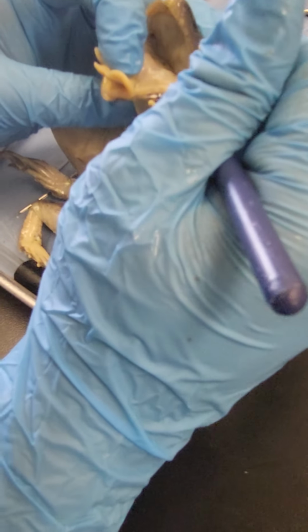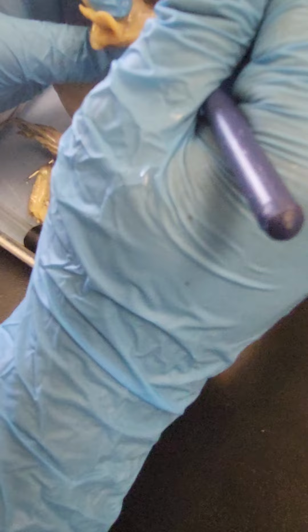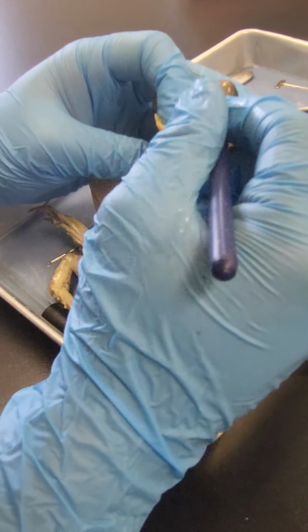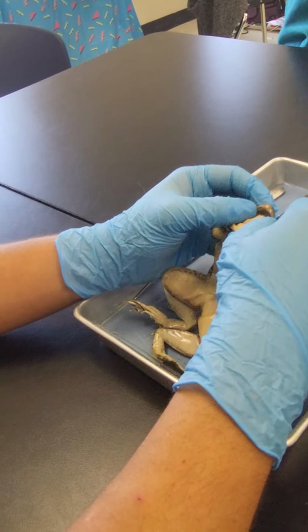In the maxillary teeth, I'm finding the edge of the mouth. For holding prey, frogs swallow their meals whole and do not chew. Run your finger over both sets of teeth and note the differences between them. Ollie, caress the teeth. I can do that. It's like rough.